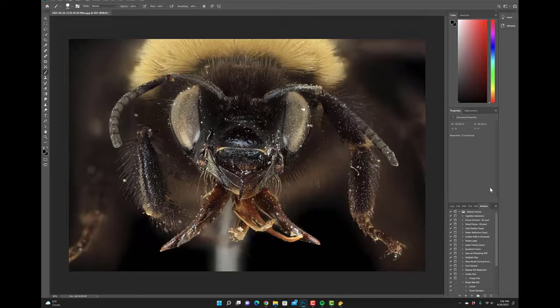All right. So this is where a touchscreen monitor comes in really helpful. If you were to step back a little bit and look at the image altogether, you can see it looks like it's slightly overexposed. The areas in the background are quite bright, perhaps a little too bright and washed out. This area looks like it's properly exposed, the part we're actually looking at. But some of the background information, like here's the pin, looks like it's washing out the areas of interest. Now, there are really easy ways to fix that washed out look.